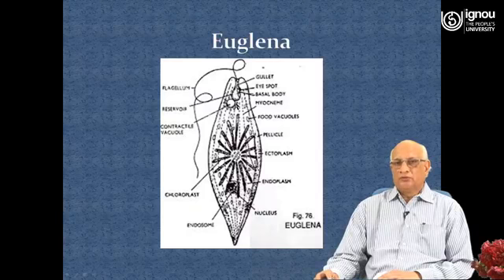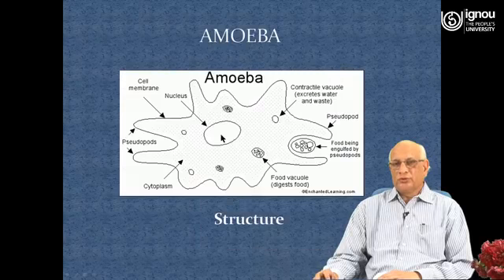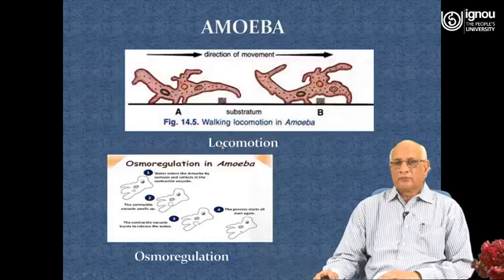Cyclosis means the movement of the food vacuole inside the protoplasm, and during this movement, again the pH of this vacuole is changing from acidic to basic. So it can be compared with the digestive system of the higher animals, when in the stomach the medium is acidic due to presence of HCl, and when it is coming up to the region of intestine, it is basic as the acid is neutralized. So the same is the pattern inside the Euglena. Initially the medium is acidic, and slightly then it is neutralized, then basic, and again we should come to the back slide.